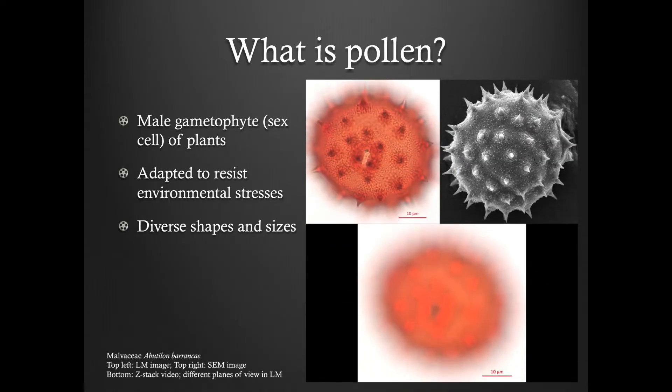Here is an example of a Malvasi pollen grain. The image on the top left was taken with light microscopy. The image on the top right was taken with scanning electron microscopy. On the bottom is a Z-Stack video. This can be a helpful tool for palynologists.